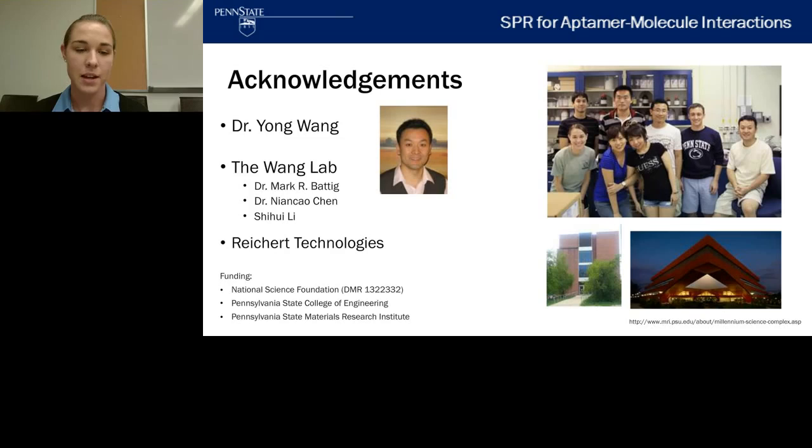So divalent cations are important and are especially associated with a lot of aggregation and binding. And this work has been done by a lot of groups, especially when looking at buffers and the importance of these cations in the binding of aptamers to other biomolecules. But our group does not specialize so much in the SELEX process in regards to this, and more so in the testing of aptamers to create biomaterials, functional biomaterials.